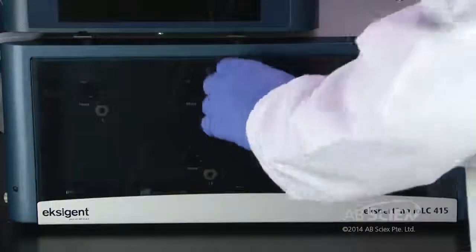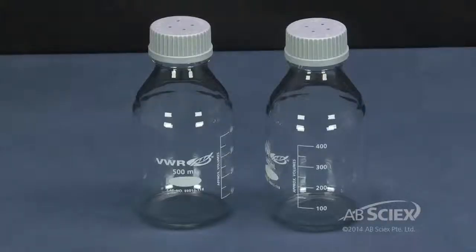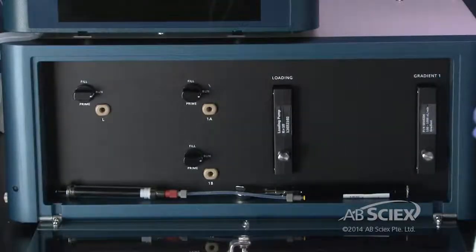Open the mobile phase cover. Identify the mobile phase position to be changed. Place the mobile phase inlet tubing for the appropriate channel into a bottle containing the desired mobile phase.